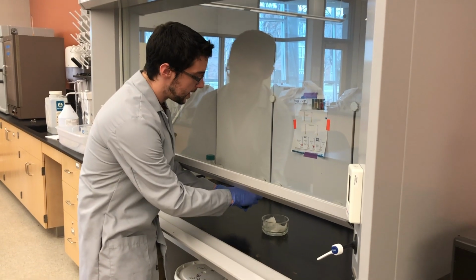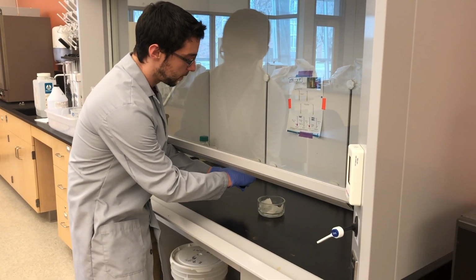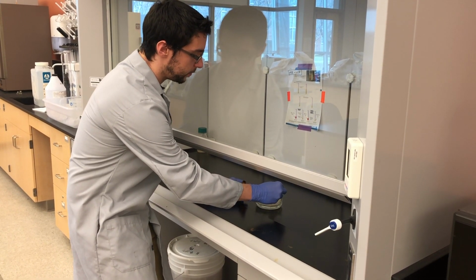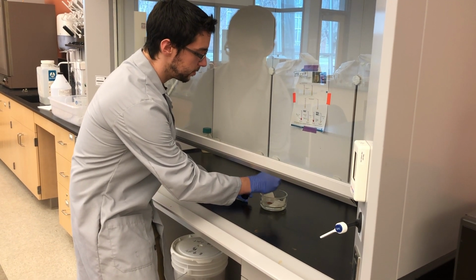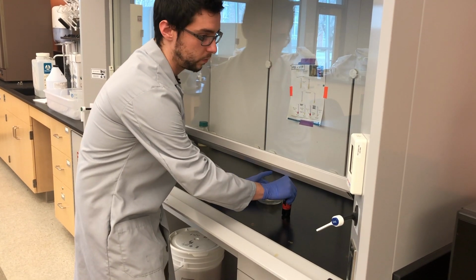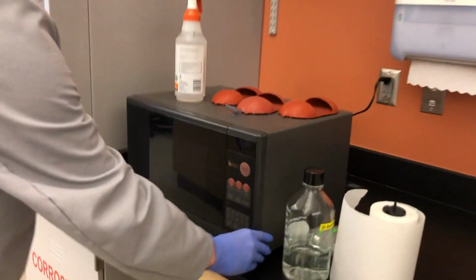It's a nasty dye, so we want to limit our exposure to it. So add the dye here. Make sure you cover where you have your smears. And then just like with the endospore stain, we're going to microwave for 30 seconds.